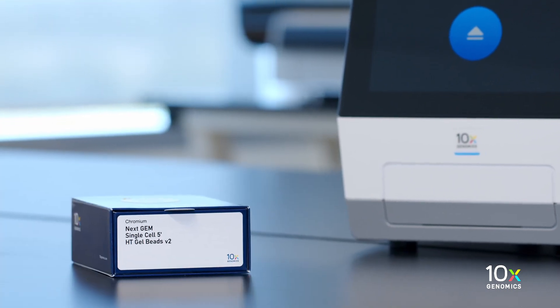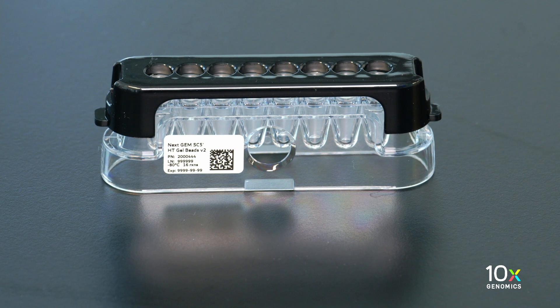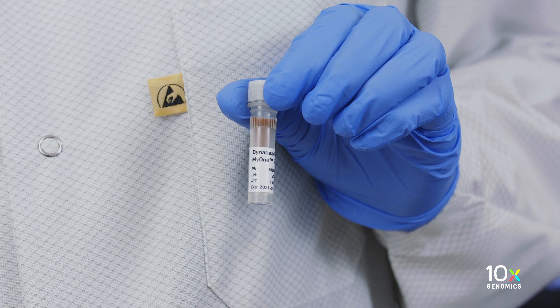The Chromium NEXTGEM Single Cell 5' HT Gel Bead Kit V2 is stored at minus 80 degrees Celsius. The Dyna Beads Mi1 Silane are stored at 4 degrees Celsius.